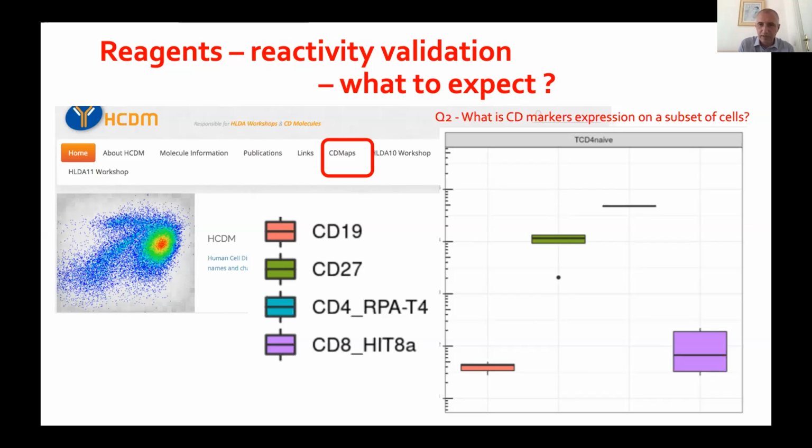They are positive for CD4 and for CD27, and you even can read out quantitative information. And this resource was published in Frontiers in Immunology last year, and you can select any cell subsets, markers to be measured and any number of monoclonal antibodies.